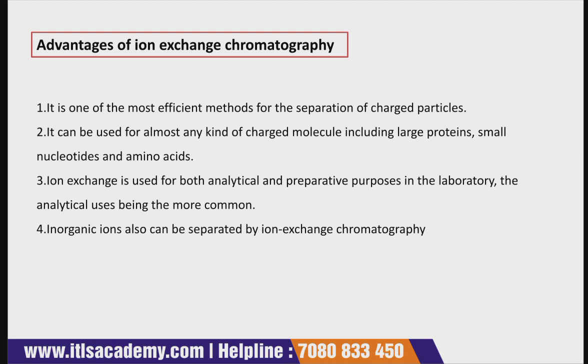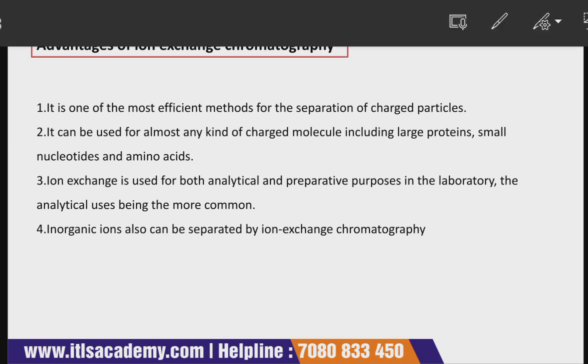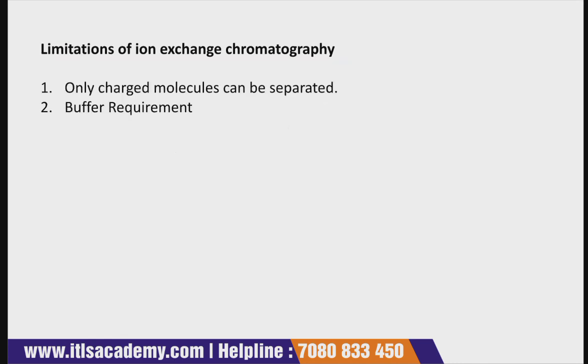If you have advantages of any technique, there are certain limitations too. If you see the limitations of ion exchange chromatography, only a charged molecule can be separated by this technique. If you want to separate a charged molecule, then this technique is very useful.